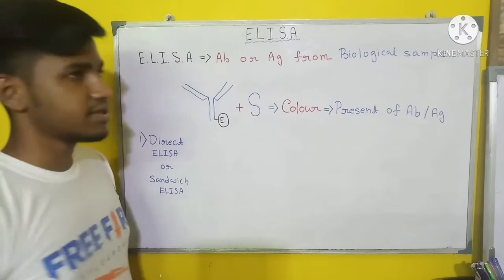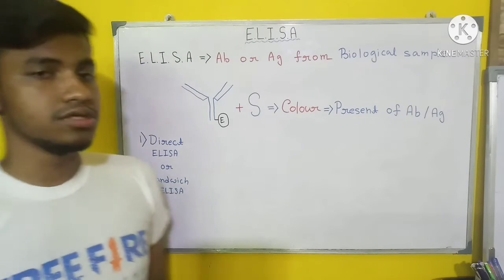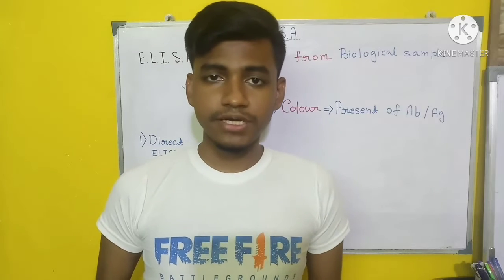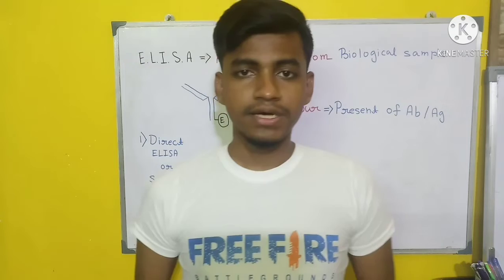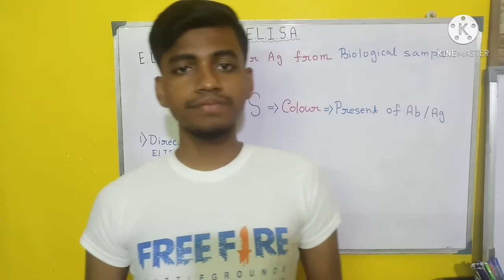This type of ELISA is used to determine a particular antigen which is present in the serum sample of a patient.